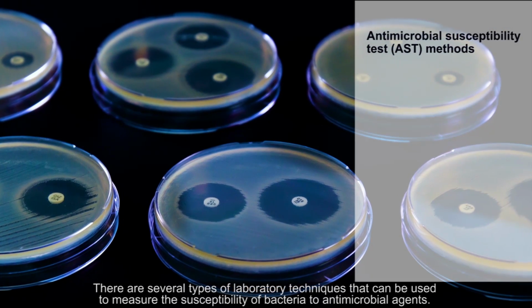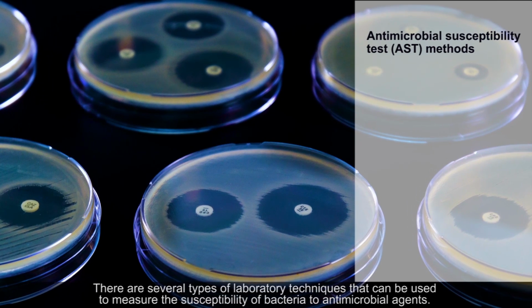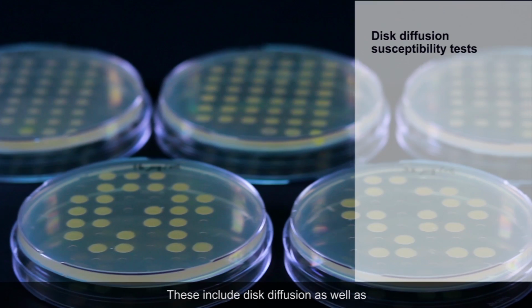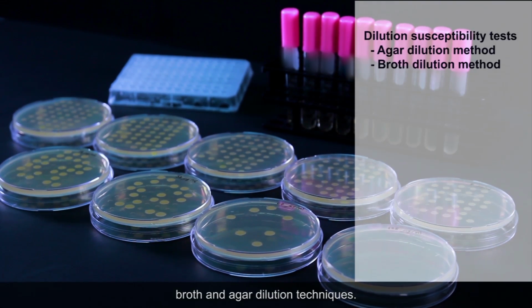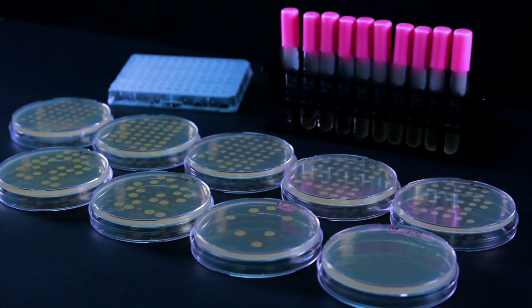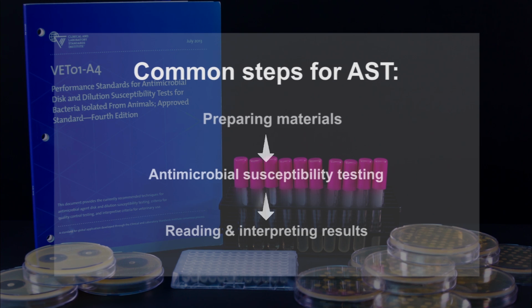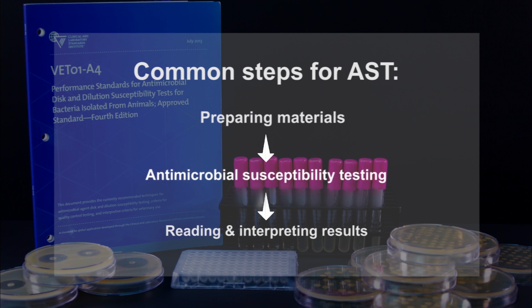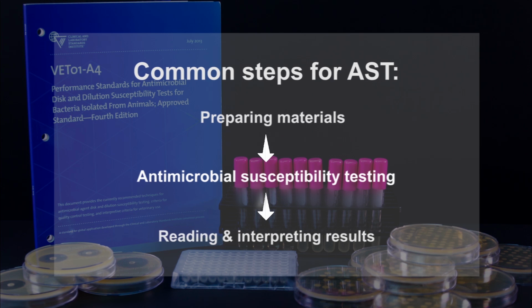There are several types of laboratory techniques that can be used to measure the susceptibility of bacteria to antimicrobial agents. These include disc diffusion as well as broth and agar dilution techniques. The common steps for antimicrobial susceptibility tests are preparing chemicals and materials, antimicrobial susceptibility testing, and finally, reading and interpretation of the results.